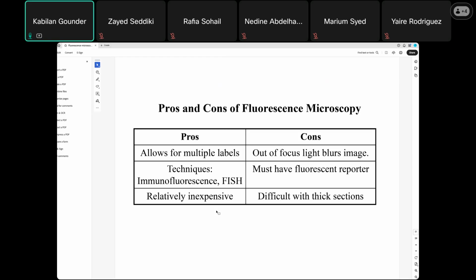Because you can use multiple color imaging, that means the different fluorophores you use may interfere with your imaging. Also, if you have thick sections, it won't be properly expressed, because that will reduce the quality of your structure imaging. So sometimes this is a drawback for fluorescence. But nowadays, we have more technique experience and different sensitive microscopes that help to solve all this.